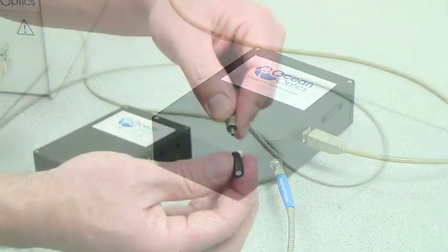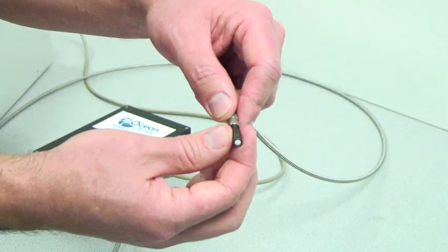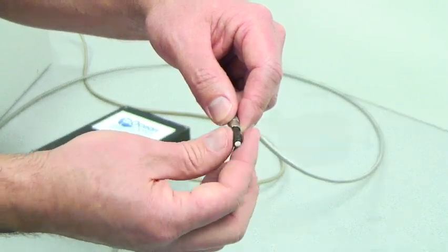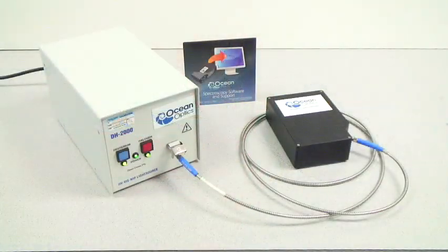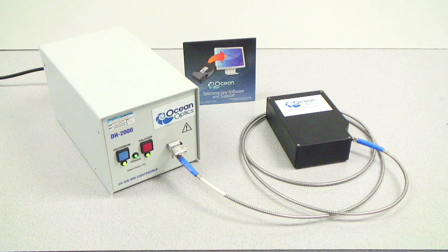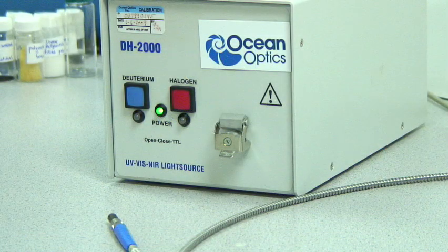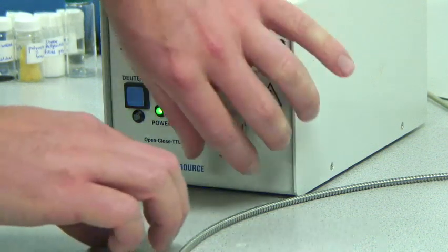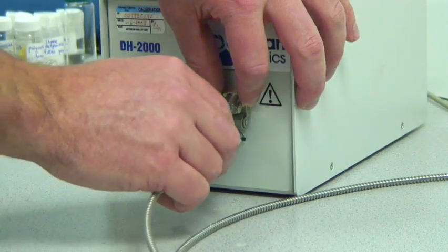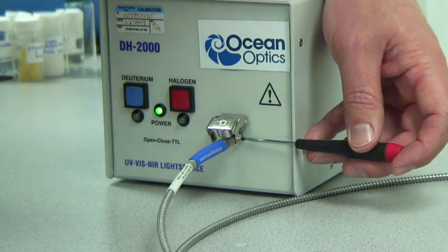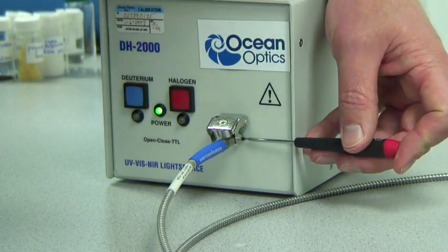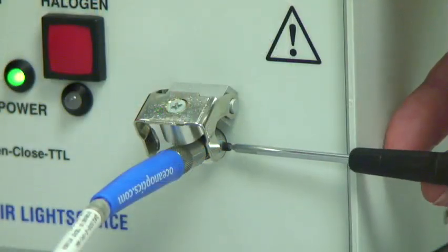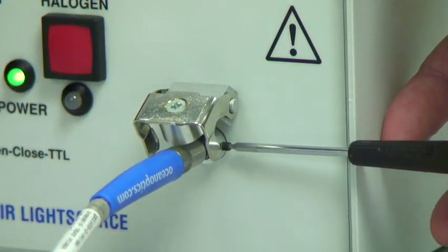Connect the other end of the patch cable to the cosine corrector. Remember that once connected, the entire system must remain intact for the calibration to stay valid. Insert the cosine corrector into the port on the front panel of your light source. Make sure that the cosine corrector slides all the way into the port on the light source and then retighten the set screw.